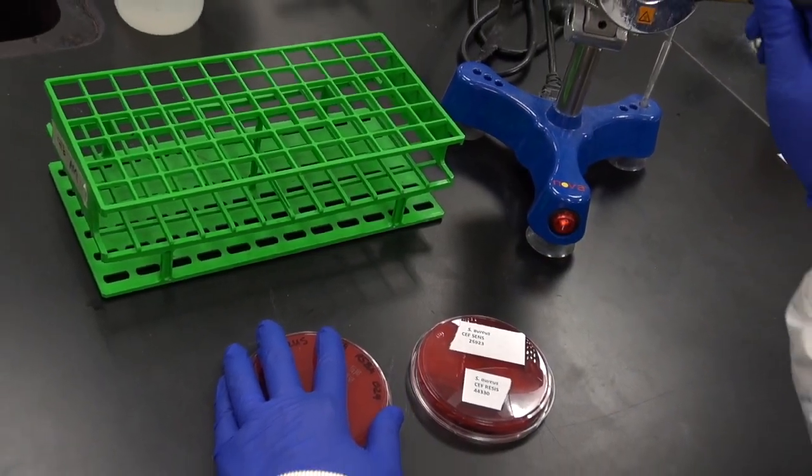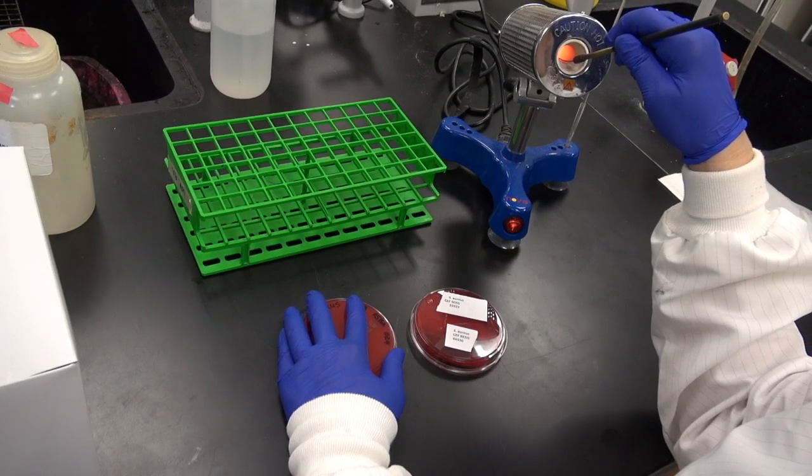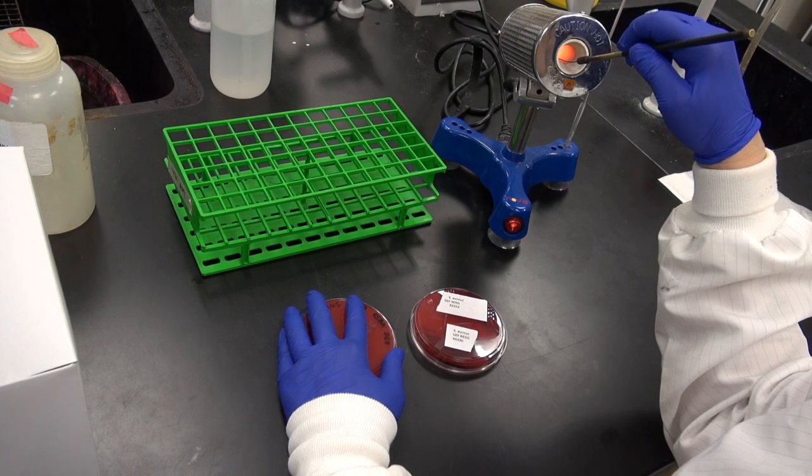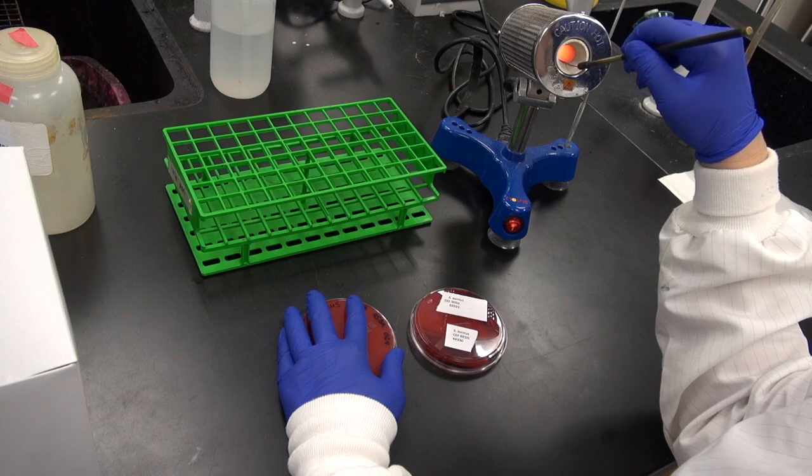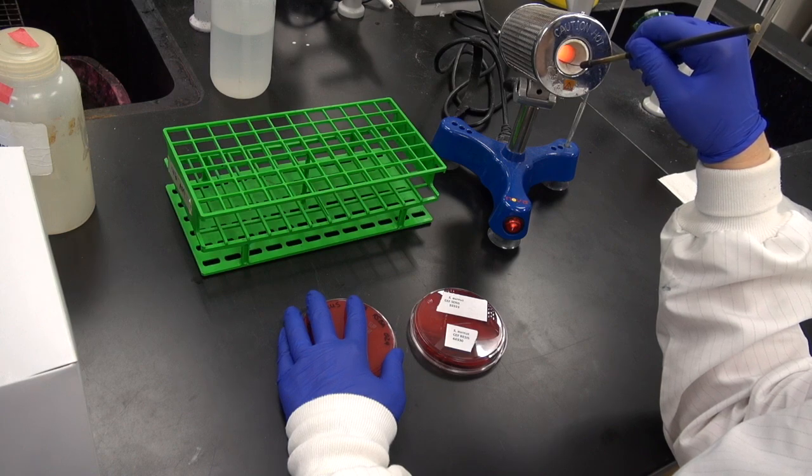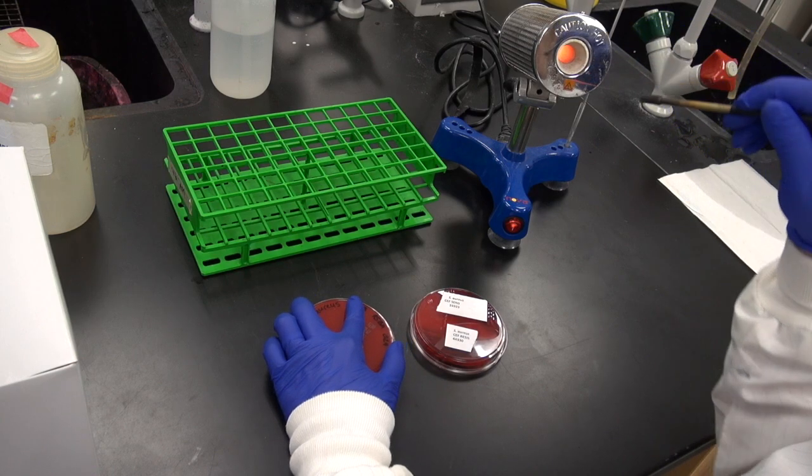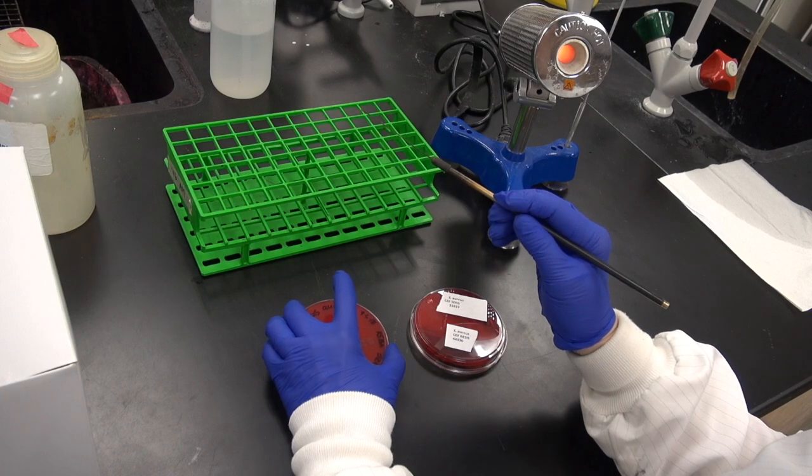The idea is to separate the bacterial cells so that they will grow into separate colonies. Close the plate, heat and cool the loop as before, and start the third quadrant.